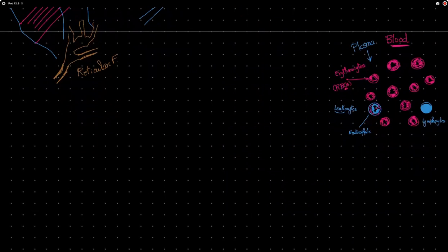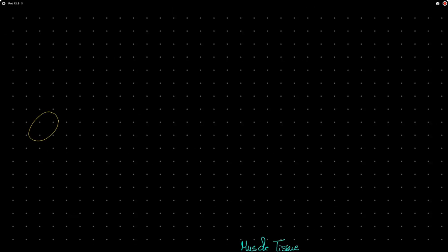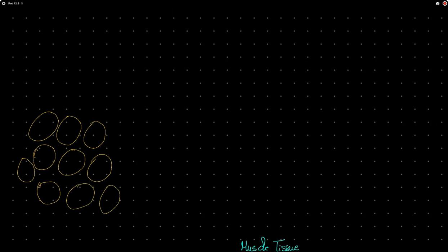Another type of connective tissue where I don't see clear fibers because the fibers got squeezed between its cells. The cells are occupying most of the size of the tissue. They look large in size. They are vacuolated, with a large vacuole inside. And those large vacuoles were filled with triglyceride or fat. Those large vacuoles were compressing the nucleus against the wall of the cell, which gives me this signet ring appearance of the cell. Those are my fat cells.